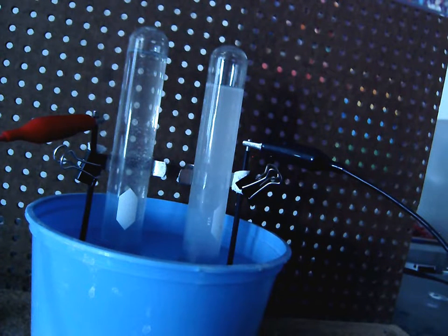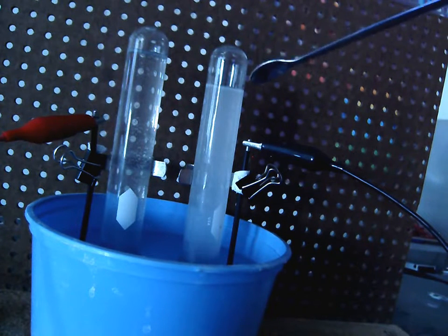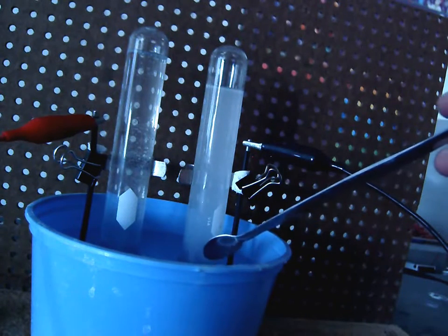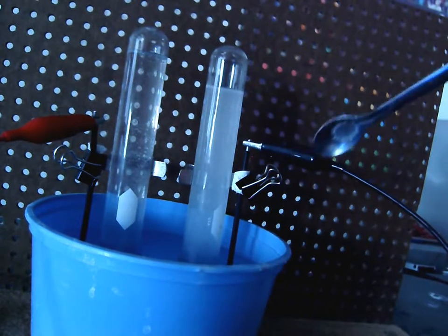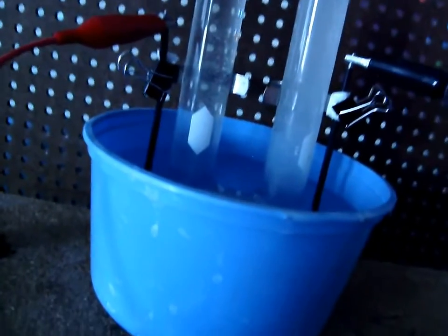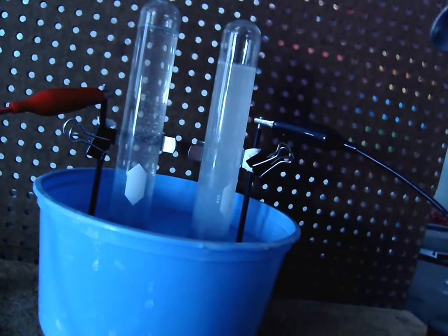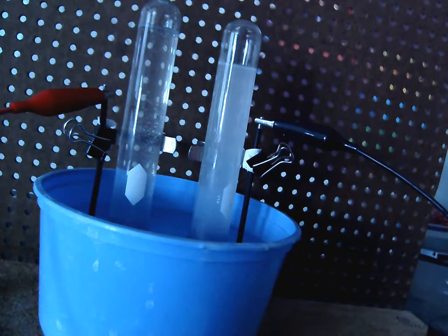So if we set all this up just as you see it and we ran the experiment, we would be able to separate the hydrogen from the oxygen. The only thing is it would happen really, really slow. So you wouldn't see this really impressive amount of gas being produced in this electrode, that just has gas pouring off of it. You wouldn't see that. You would see bubbles, but it would be much slower. So what we did before we even started this lab is we added some baking soda, like this.